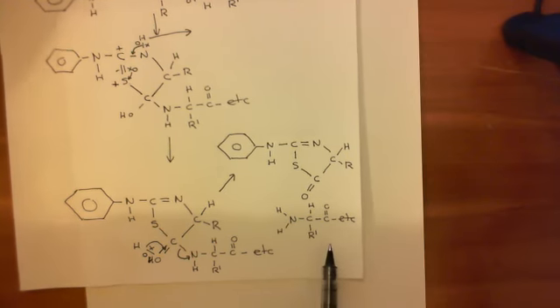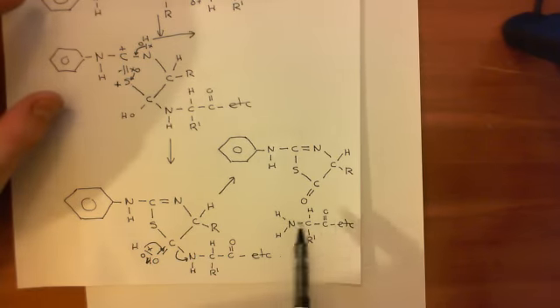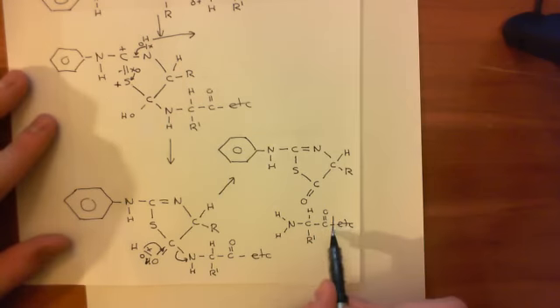It's here. So now what we can do is perform the whole process over again. Then we can work out what the second amino acid is. And then when we do the whole process again, what you'll end up with is another fragment of the polypeptide after that cleaved off.